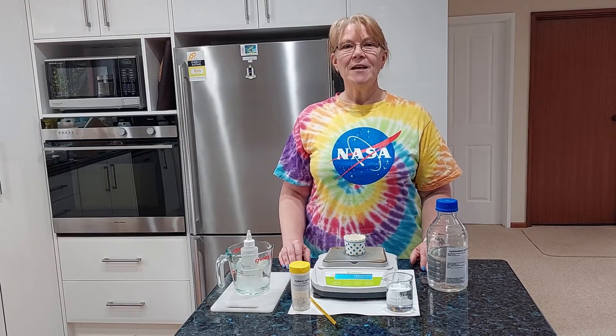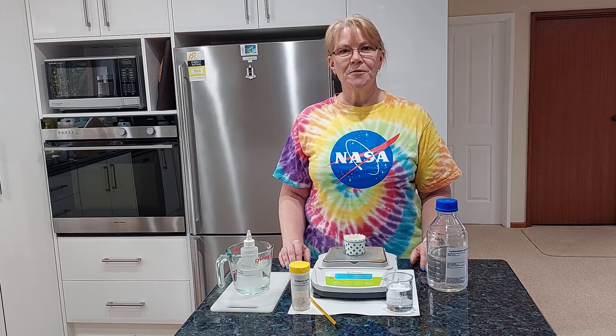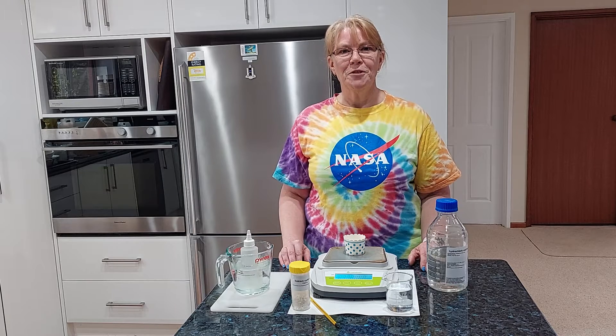Hi everyone, Mrs V here and we are still in the Lockdown Lab. Today's experiment is going to look at the effect of temperature on the rate of reaction between hydrochloric acid and marble chips.